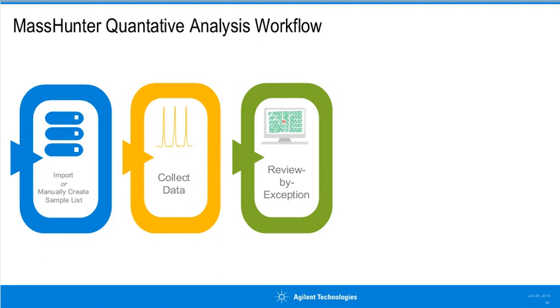Compounds at a glance. Now I think it's time to move into discussing the reporting capabilities.